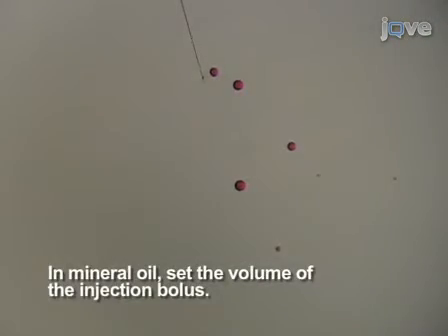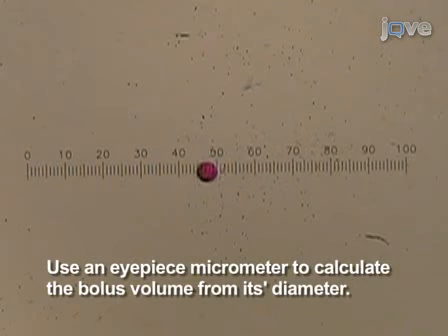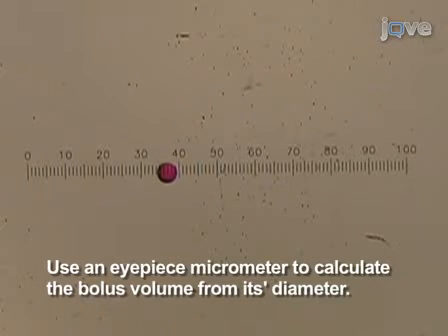To determine the volume of dye or ribonucleotide being delivered, before starting, measure the bolus size in a dish of mineral oil. The needle should be broken off so that a bolus of 1 nanoliter is delivered with 1 or 2 pulses of the microinjector. The volume of the bolus can be calculated from its diameter as measured by an eyepiece micrometer.